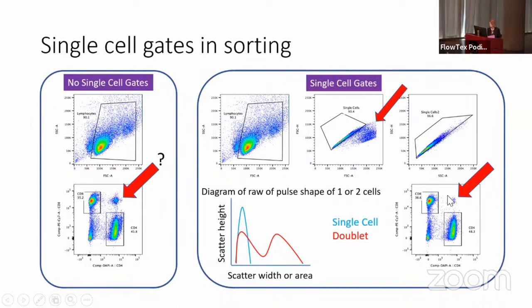Once you've done that, it's not perfect. There's probably still a few CD4, CD8 double positives. Maybe these are biologically interesting. You need to do more work in your system, but don't start with these guys where we know they're not real.